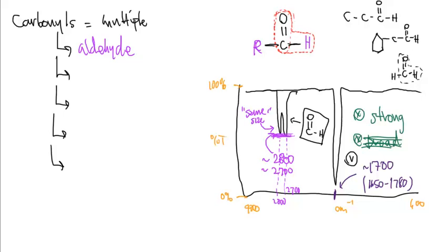Meaning, I don't really see one that's like a little jagged piece like this and another one that comes way down and then back up, right? That's not the presence of the aldehyde. The aldehydes are typically about the same size. They won't be perfectly matching, but they'll be on the order of magnitude that's about equivalent to each other.